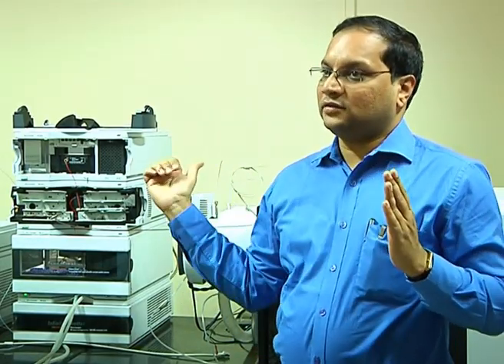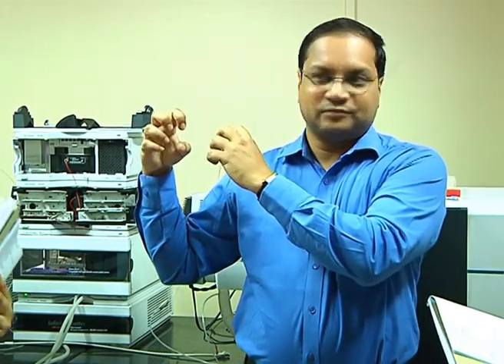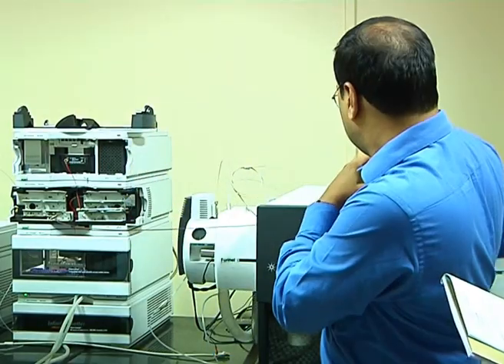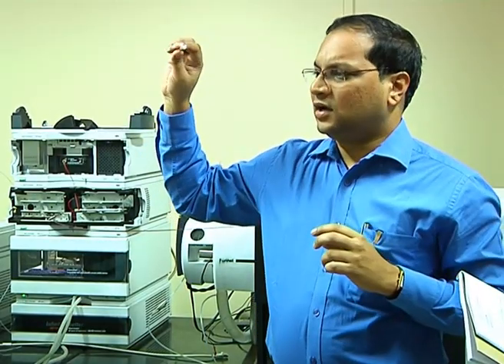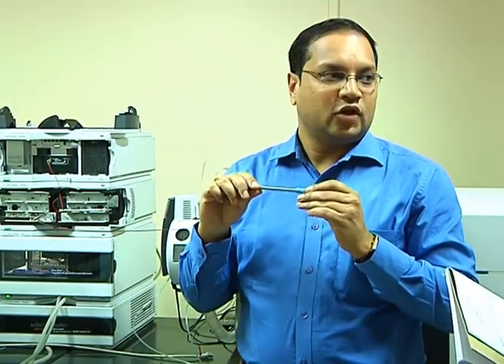To reduce that complexity, we use a separation technique before the MS so that your peptides get retained based on their hydrophobicity in the stationary phase, which we call the HPLC column. If anyone has not used an HPLC, it looks like this. It has some stationary phase, typically silica-based, depending upon what type of chromatography you are doing.